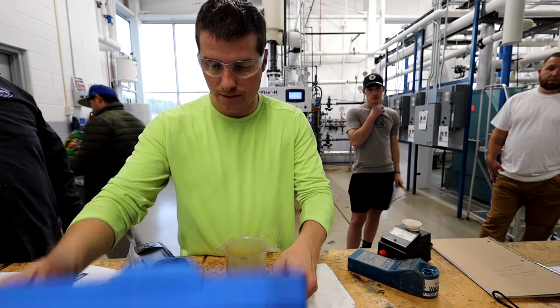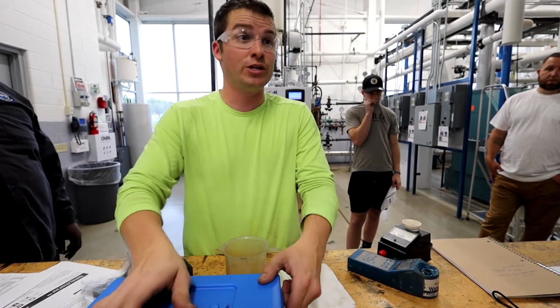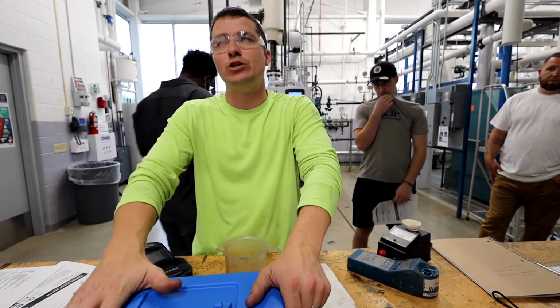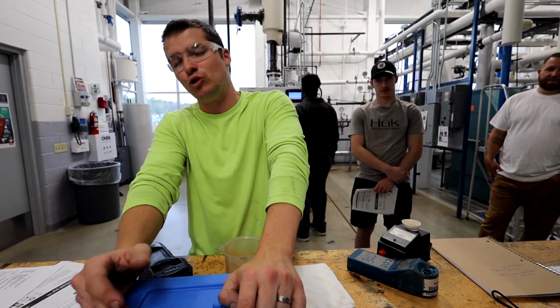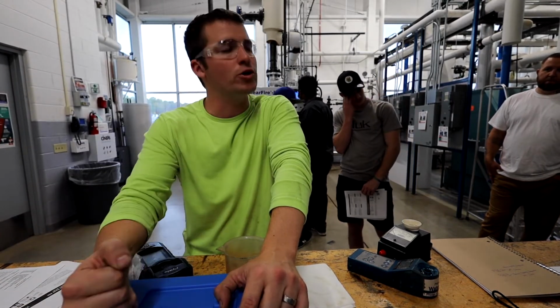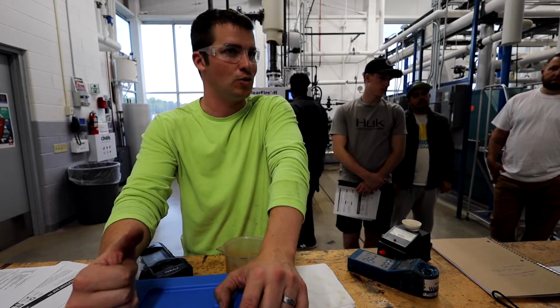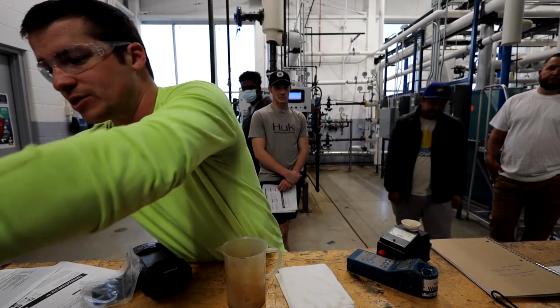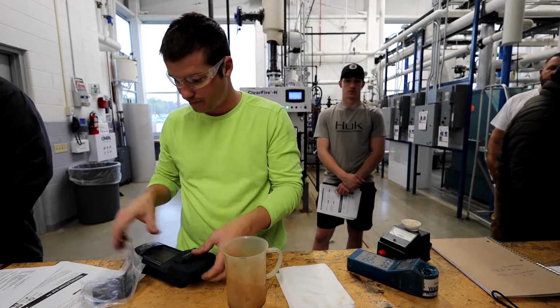That's our iron test. So we're not going to have to perform that iron test in the boiler, because if it's good in the feed water, it's going to be good in the boiler. Well, not always, but it should. Yes, it should be 99.9% of the time. But can you have something goofy going on in your boiler specifically? Sure. But you're going to know in your boiler if you're getting iron issues because your water is going to be orange, right? You'll see it visually. Whereas when it's only 0.1, 0.2, you might not see that with your eye without doing a test.